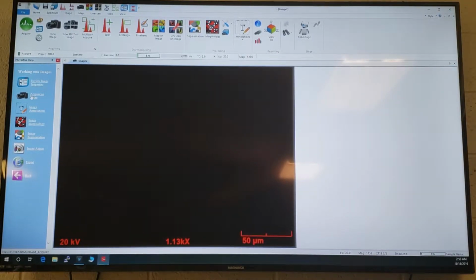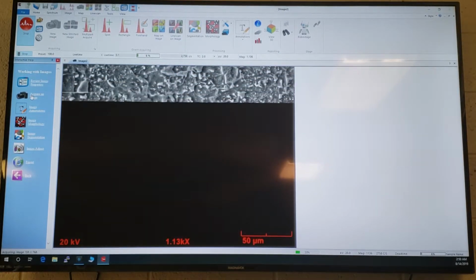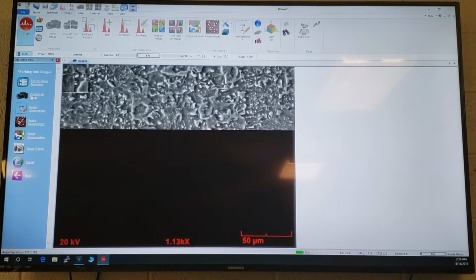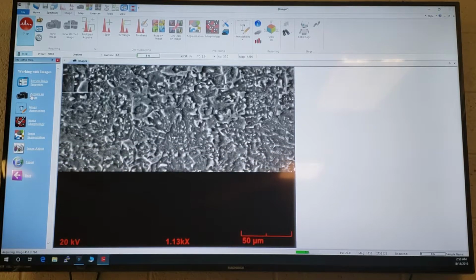So the next feature down is just acquire the image. So we just click on our camera icon, and the image gets pulled through. It's faster than the other one, just because we have the time set different. Probably have 1024, but a resolution of 4, something like that. So this one is doing 16 points. Yep.